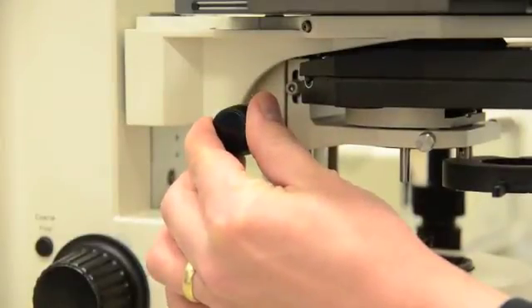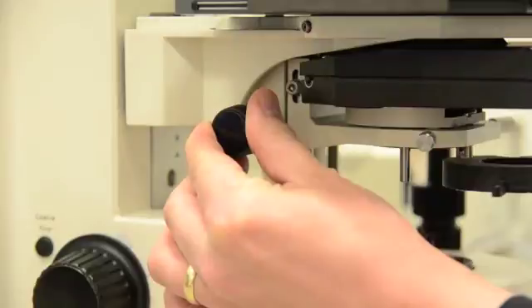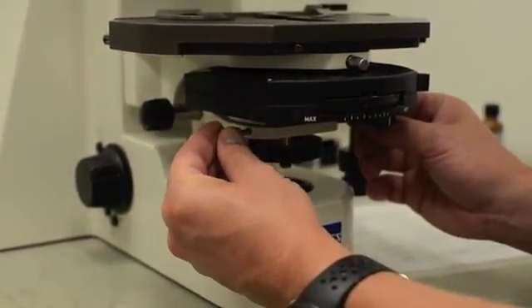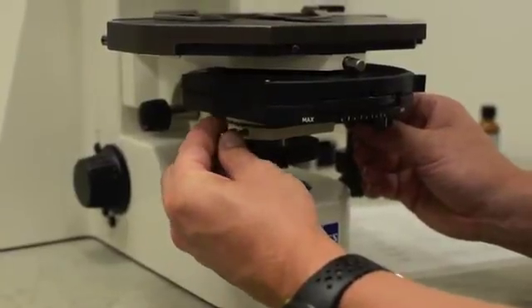Focus the edge of the diaphragm by adjusting the height of the condenser lens. Align the condenser by centering the field iris diaphragm using the condenser centering screws.